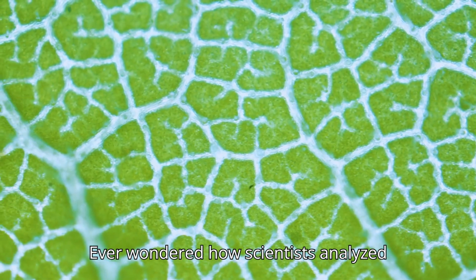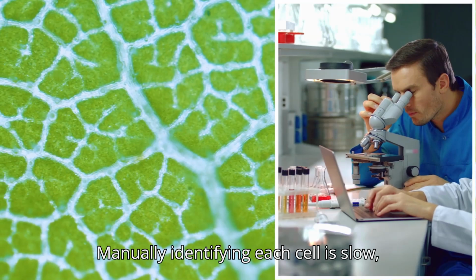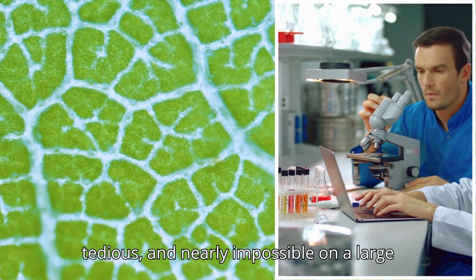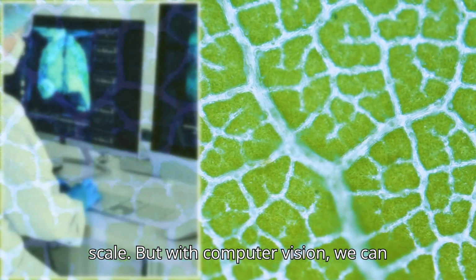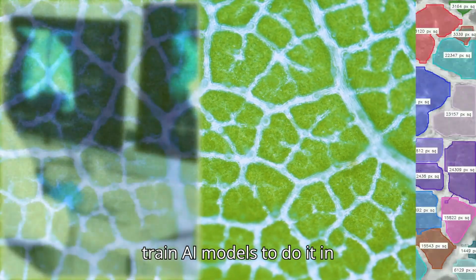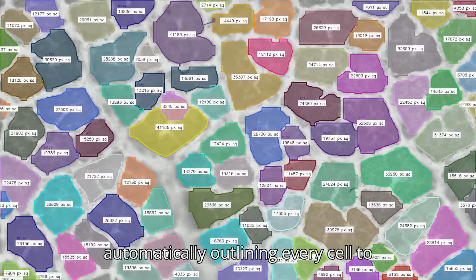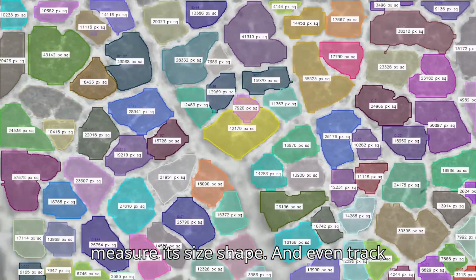Ever wondered how scientists analyze millions of cells to fight diseases? Manually identifying each cell is slow, tedious, and nearly impossible on a large scale. But with computer vision, we can train AI models to do it in seconds. This is cell segmentation, automatically outlining every cell to measure its size, shape, and even track its behavior.